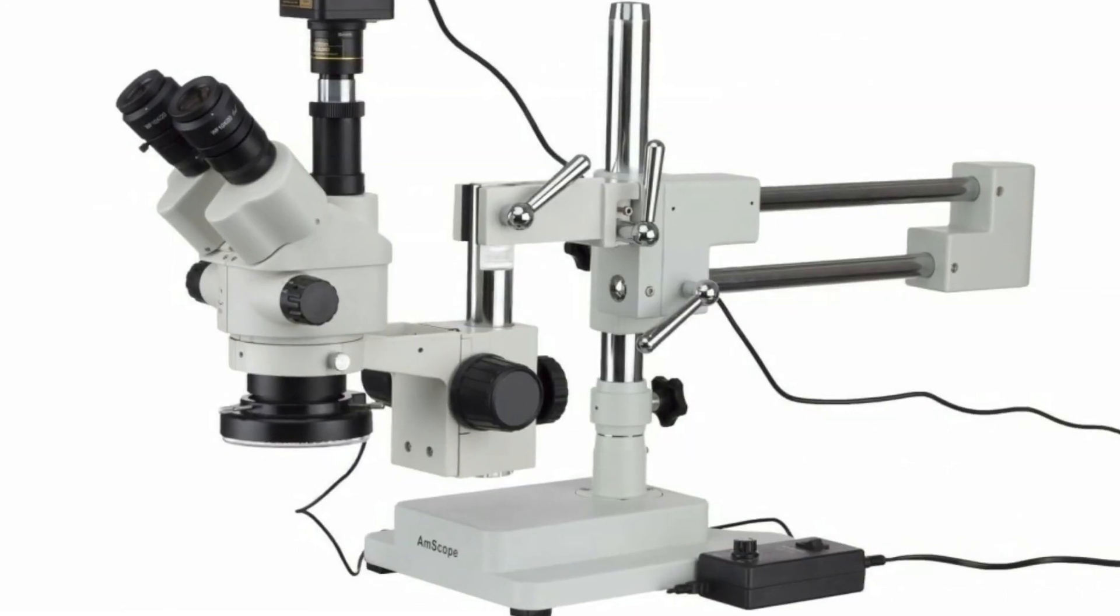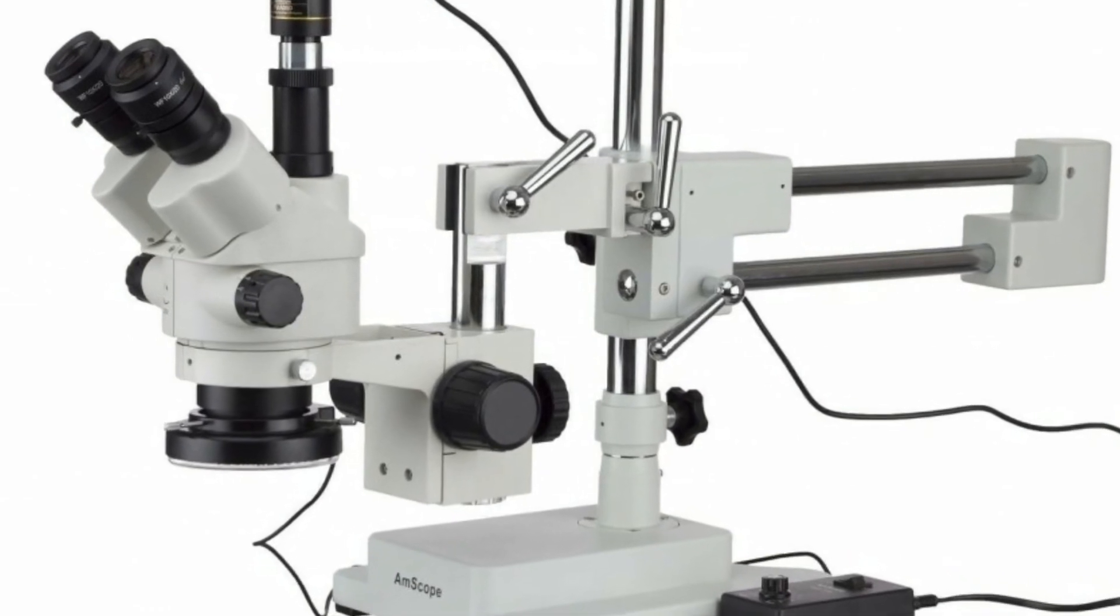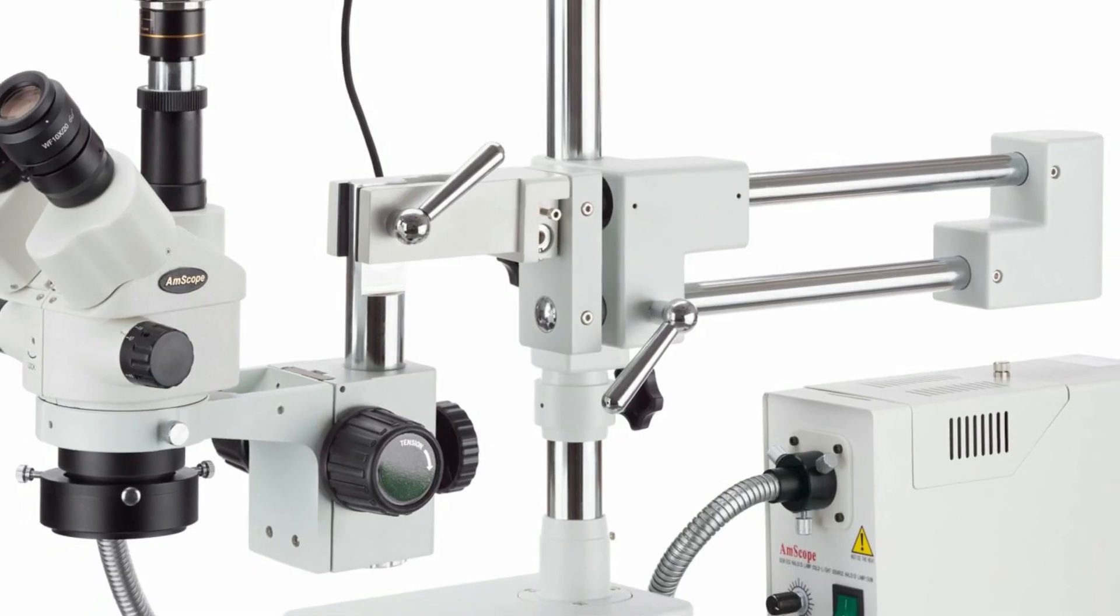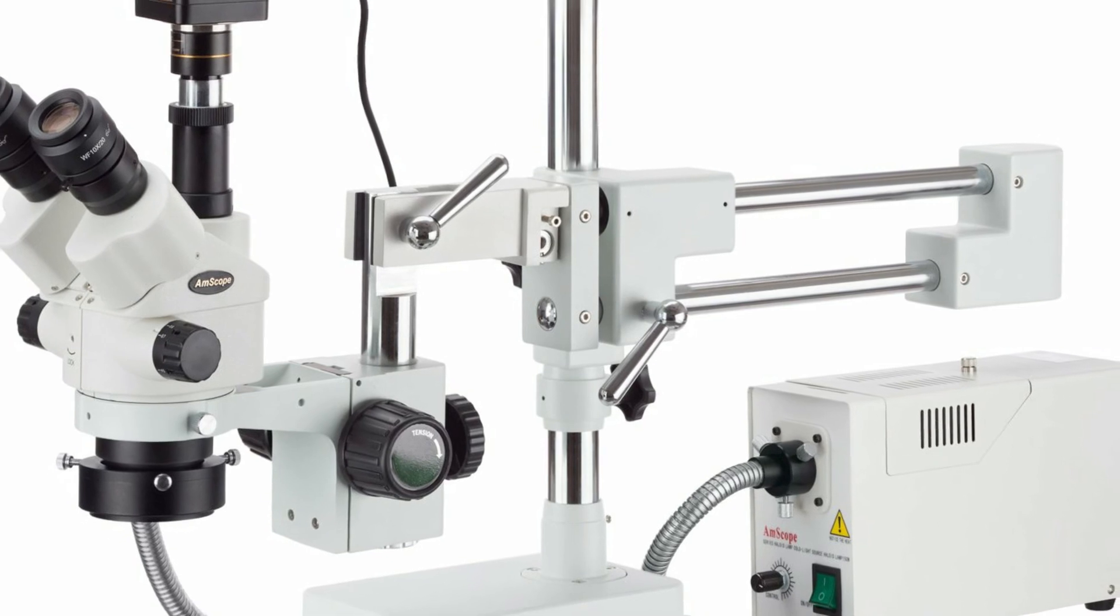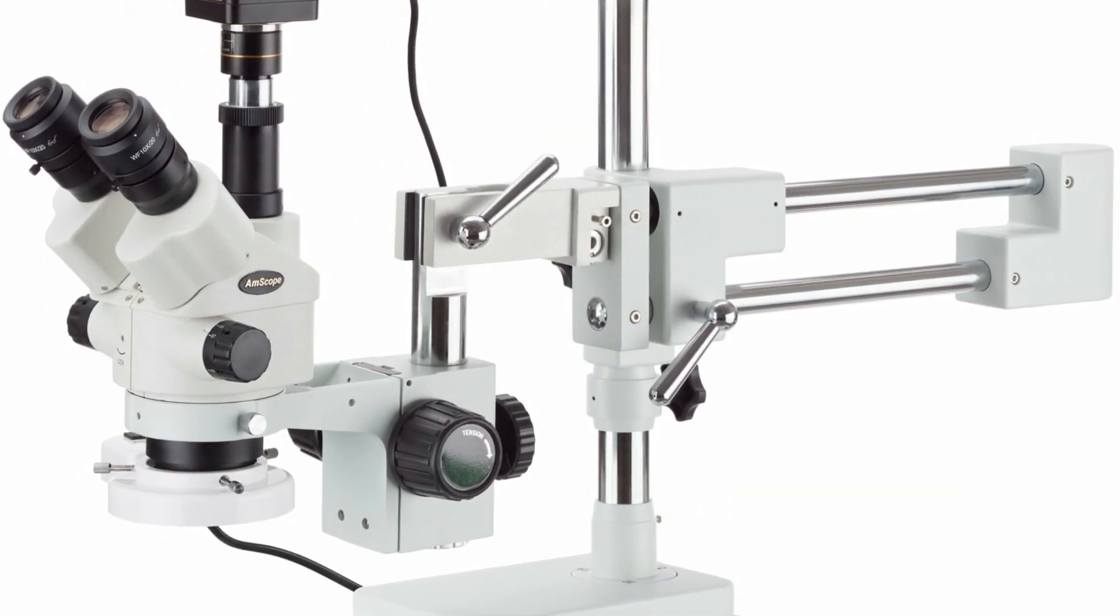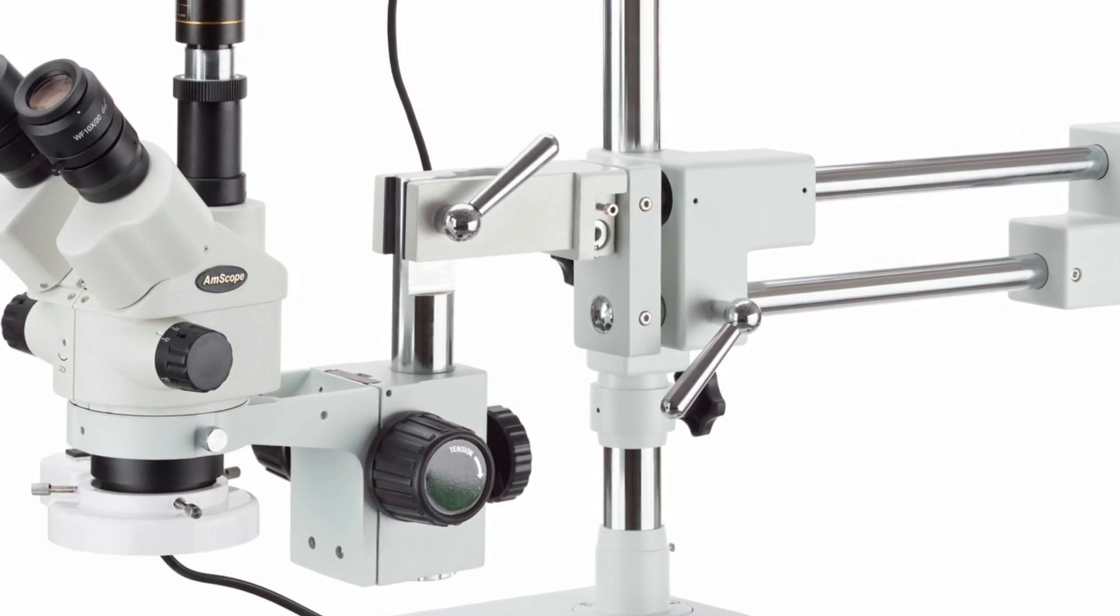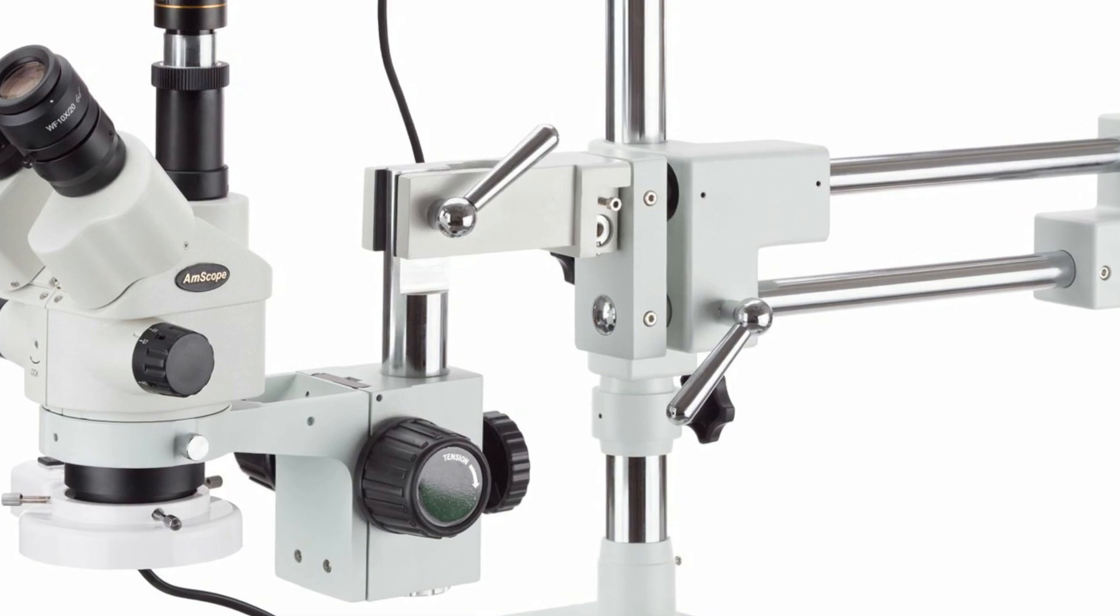The multi-pivoting double-arm boom stand provides a stable, flexible support system ideal for hands-on work. A drop-down column allows the head to be positioned at virtually any angle. Ball bearings provide smooth movement of the lateral arms, which can easily pivot the microscope out of the way when not needed. The heavy steel base ensures stability even when laden with attachments.